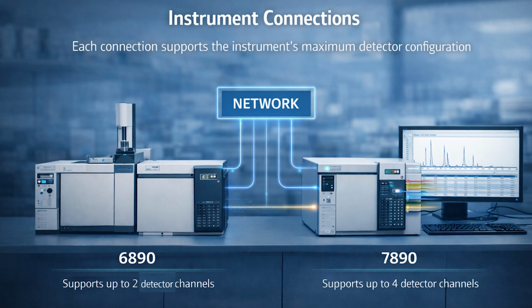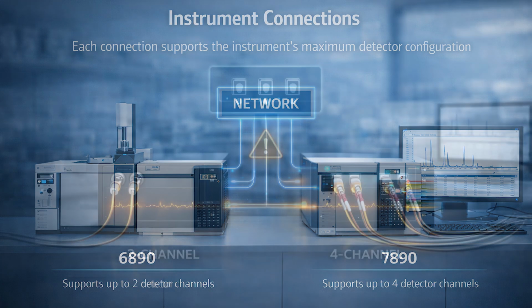For example, a 6890 supports 2 detector channels, where a 7890 can support 4 detectors. This means that even if only one detector is used today, the instrument connection already supports the full instrument configuration. This applies to both digital and analog instruments, although analog instruments have an important nuance, which we'll discuss next.